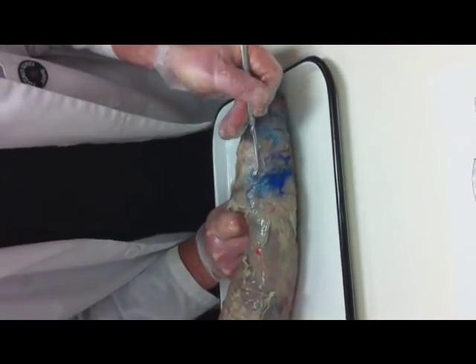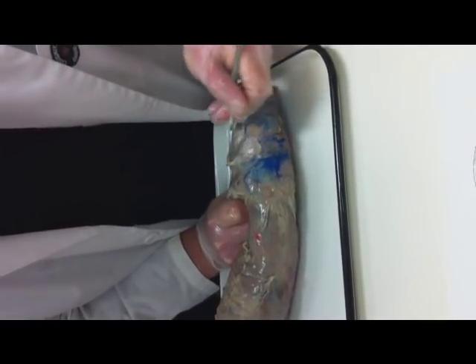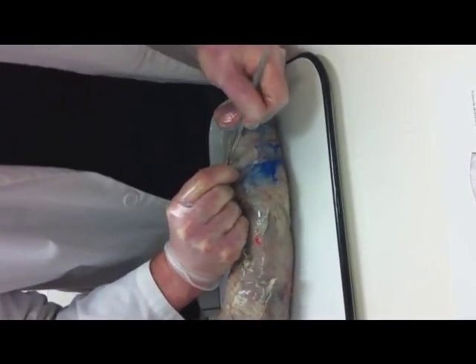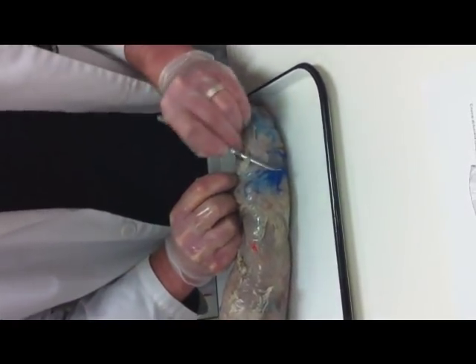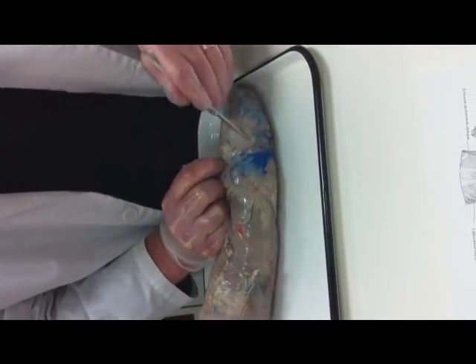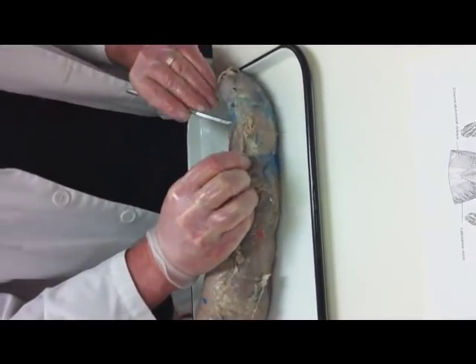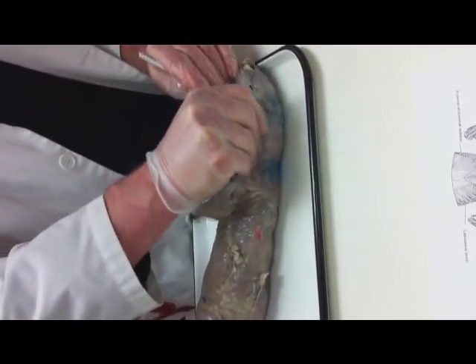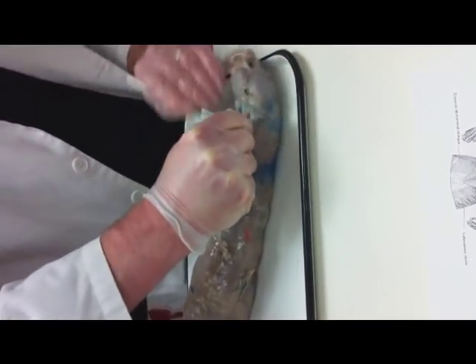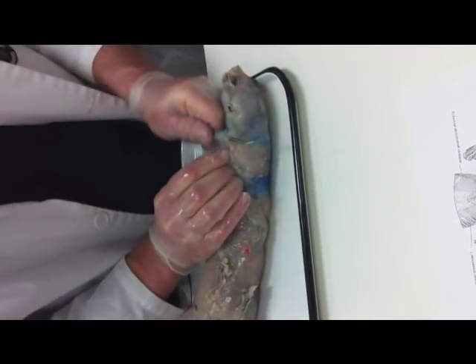Now, there are muscles here, but again, there's a good layer of fat, and that needs to come off, so I need to get underneath that. When I start taking brown stuff off, I have to stop, because now I'm down to muscle. But up until I get there, and I see all that clear stuff, all that's got to go as I pull. So you'll notice there's a certain degree of handling, a certain degree of brutality that you've got to get in there and get rid of this stuff. This blue stuff is just fat that's got latex on it, and I'm pulling up and I'm probing underneath of it. When I start to pull off something that's brown, I stop because I know that that's muscle tissue.